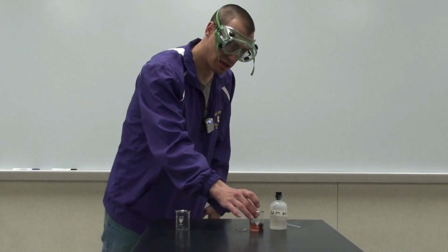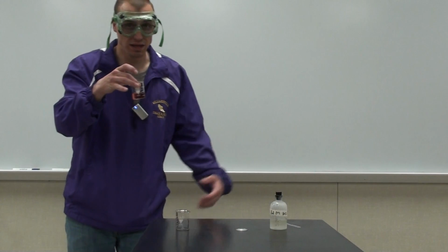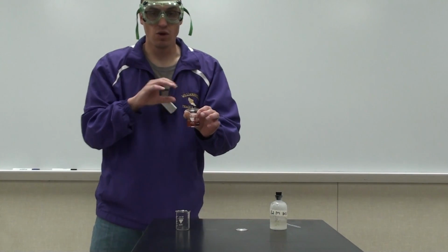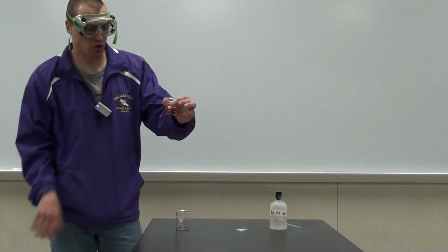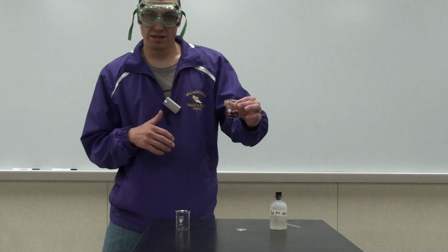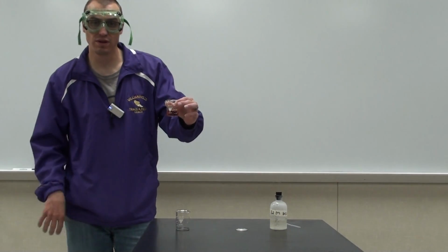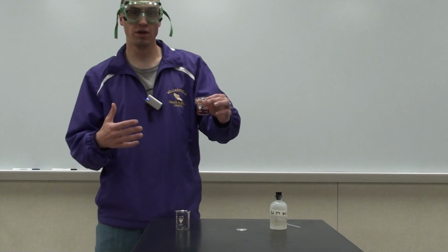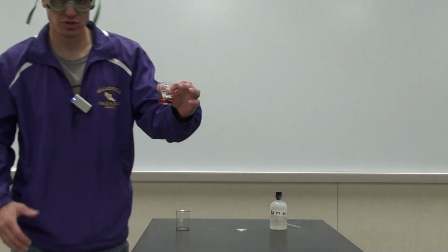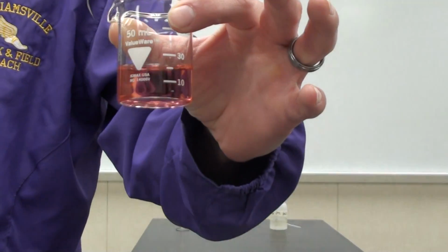So the first thing that I have in this beaker is this pink or rosé color solution. What this is, I took cobalt chloride and I added it to water and I made this solution. So what we have here is this cobalt hexa aqua complex. And I'll bring it closer to the camera so that you can see this pink rosé color.